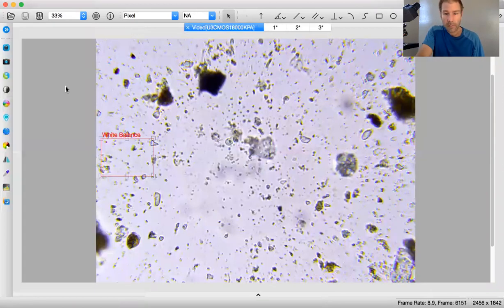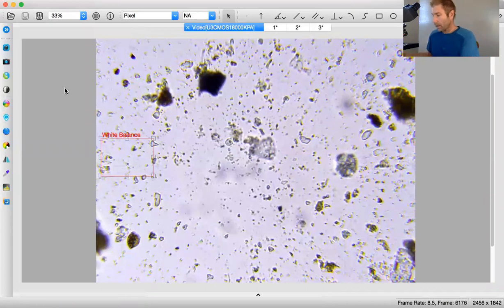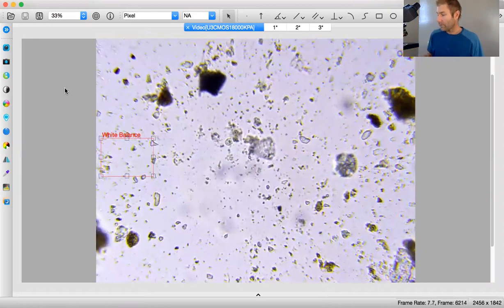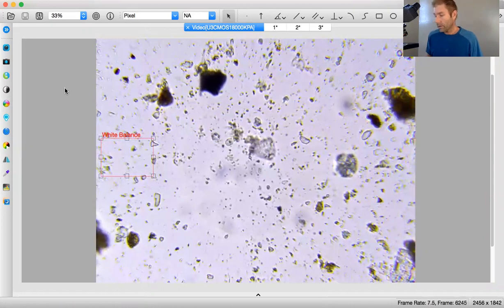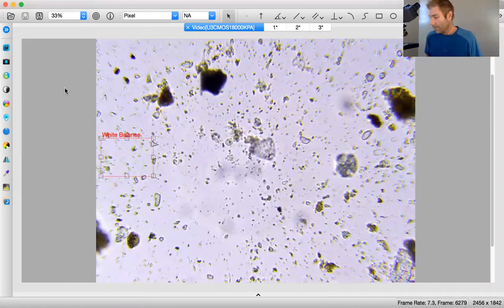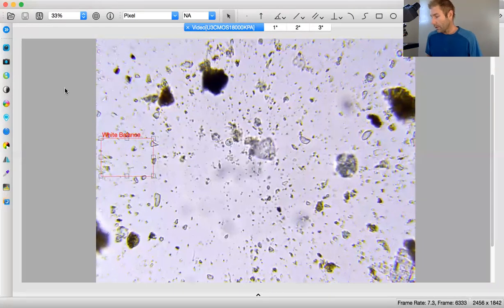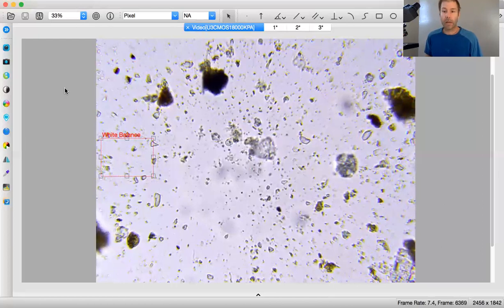Hello. My name's Tom. I will be doing my MPA3 today. I will be doing 5 readings, narrating only the first with the swimming lane approach. My dilution is a 1 to 5 today, and this is compost. My digital camera field of view is 200 by 300 micrometers. My 400x is dialed in, and I'm shadowing.